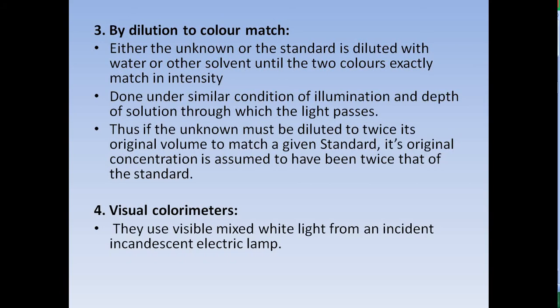Just like that. And the next one is visual colorimeters. They use visible mixed white light from an incandescent electric lamp.